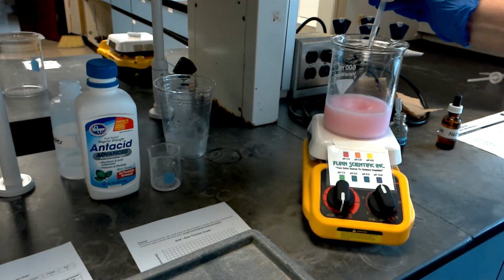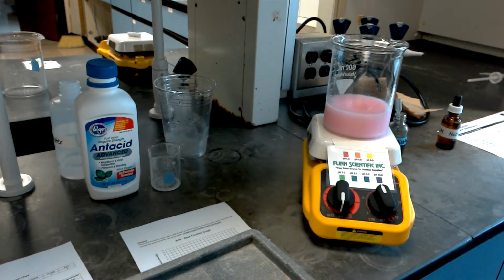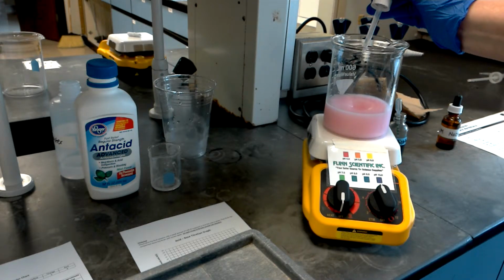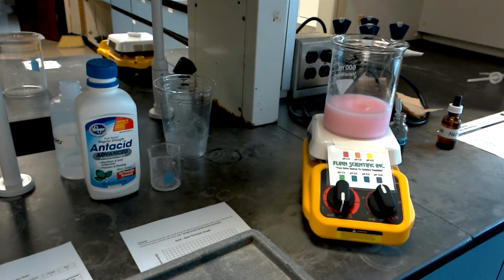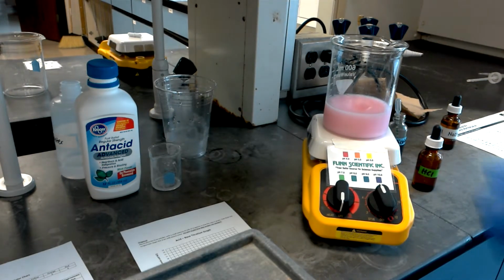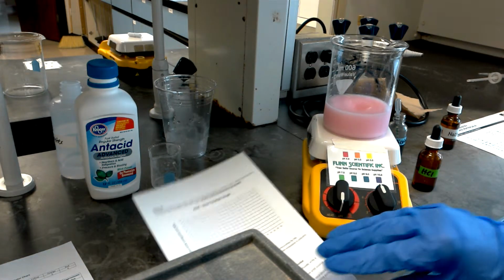I just want to show you how if you added a few more drops, you can kind of get a little bit deeper pink. But no matter how much acid I add at this point, it's not going to change the color because we've run out of range for the indicator. So at this point, the last few points in your graph are going to be just a pH of 4, a pH of 4, even though we know that it's below a pH of 4.